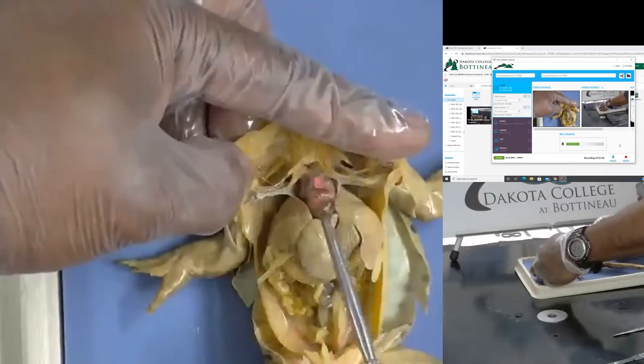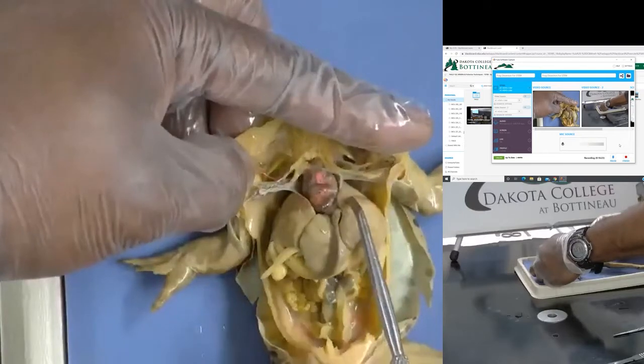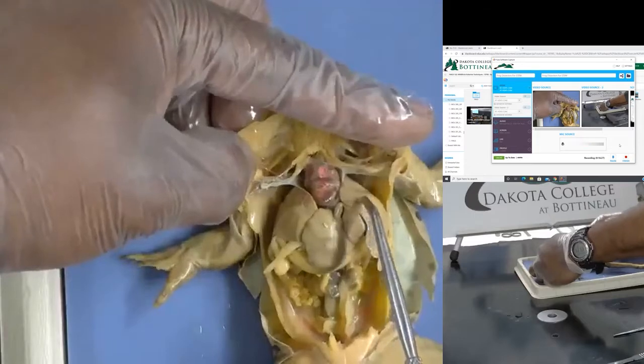In a fish, it's only two-chambered, but they have a constant supply of water over their gills that's adding oxygen to it. So they can just keep going, I guess.